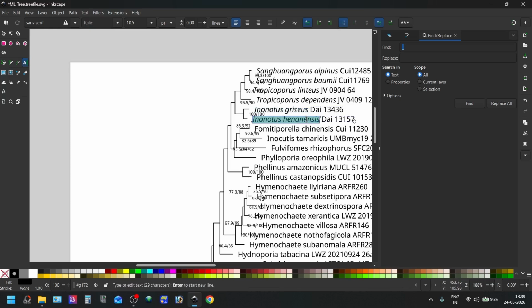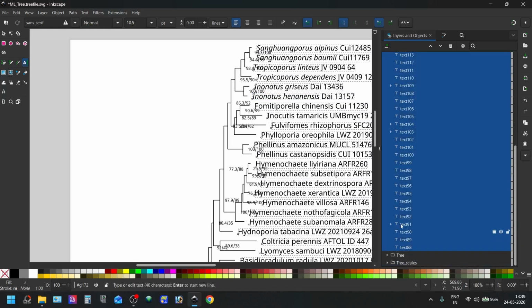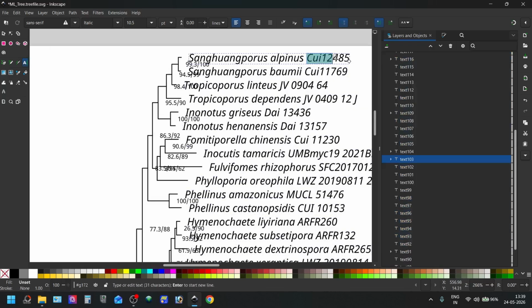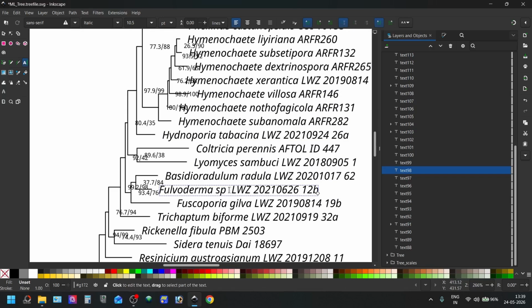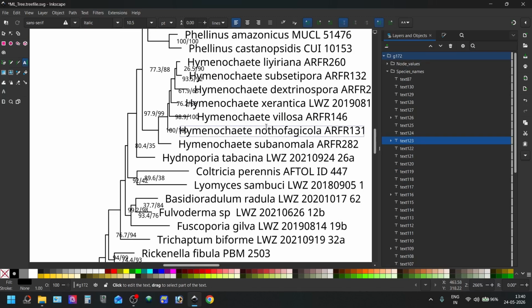And then you have to do this for all these, or you can simply also select all species names and then make them italics here. But the problem is it is also making the code italics and as well as here sp italics. So you have to again change individually each of them back to normal by clicking Ctrl plus I. So I prefer to manually make all these names italics. Like this, you have to do this for all the species.